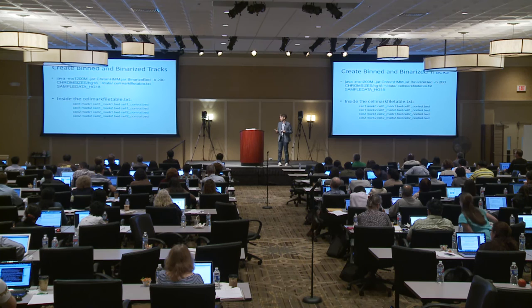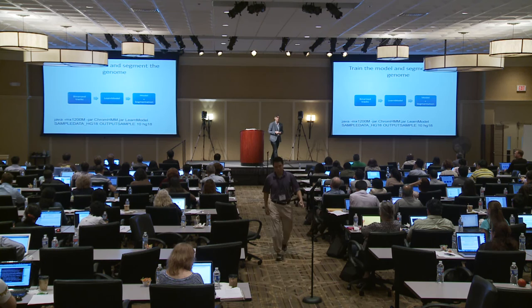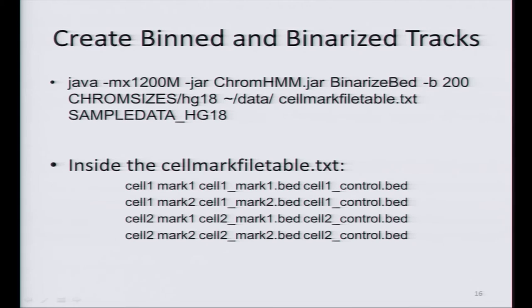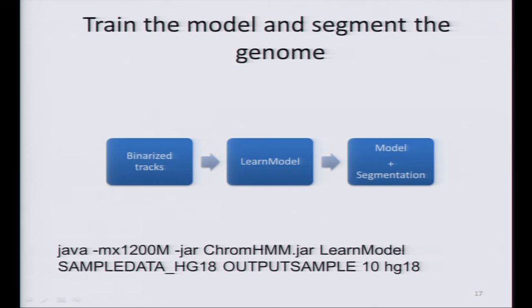Up to here we have these binarized tracks, but still we don't have the chromatin states. To get the chromatin states and to train the model, we just need one more step. We have our sample data folder created in the previous step with the binarized tracks stored there. This will be the input for the next step: we take these binarized tracks, run the hidden Markov model in ChromHMM, and we will get both the model and the segmentation.